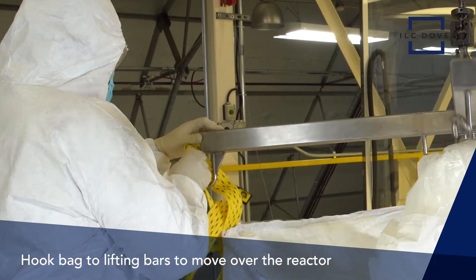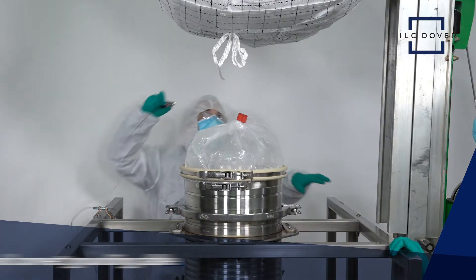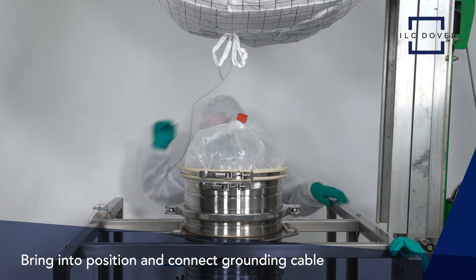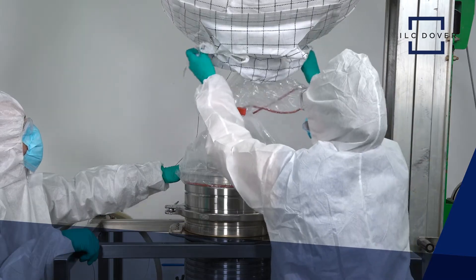When ready to empty, hook the bag up to the lifting bars to move the bag over the reactor. Once brought into position and the grounding cable is attached, it's time to connect the container using the same method shown earlier in the video.